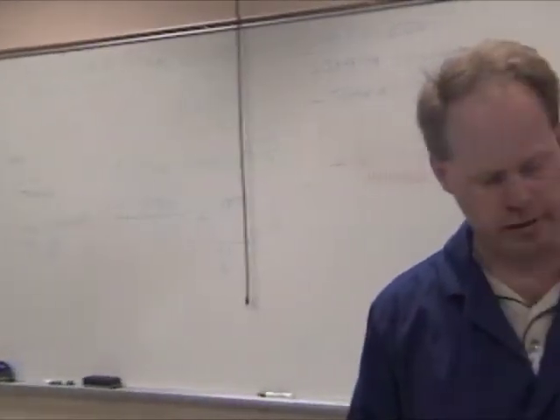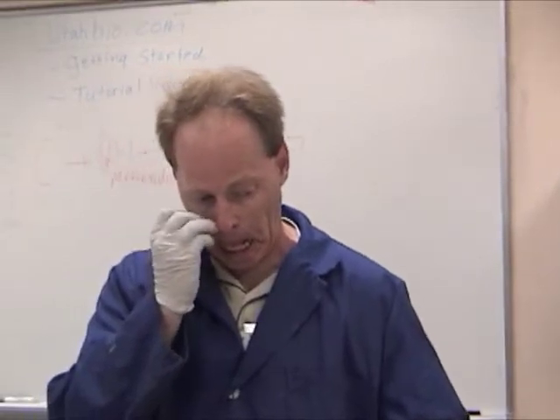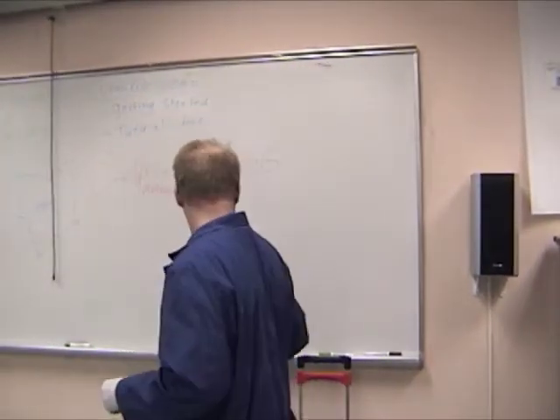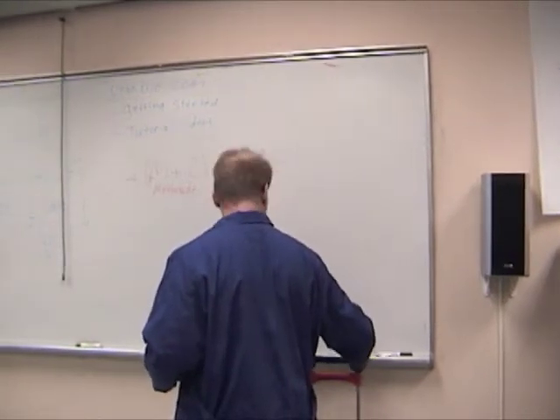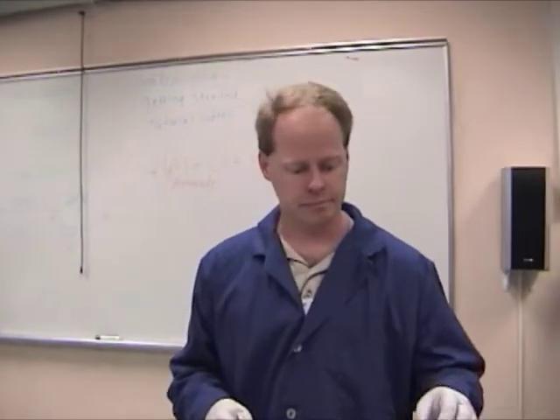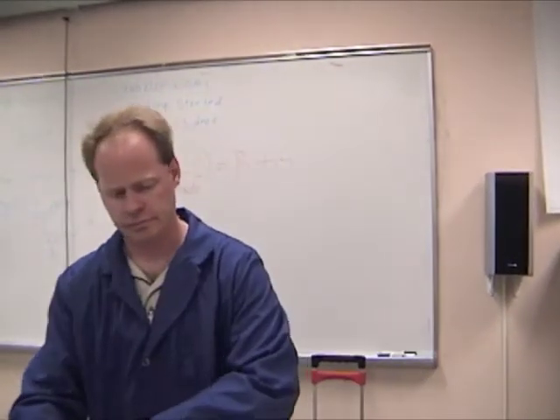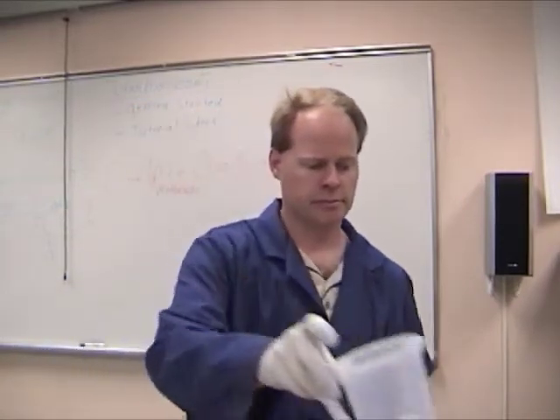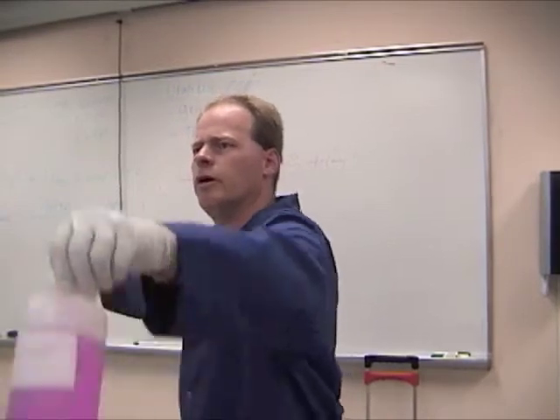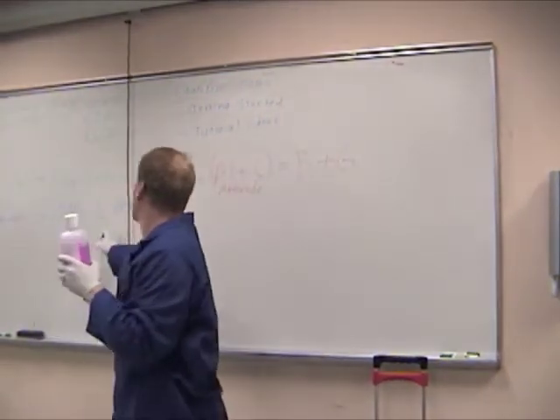Okay, you ready? That's all mixed up? Should be. Is this the good stuff to play with? Is that phenol? No, that's the 1% solution. The reason that's purple is I put 2 or 3 drops of phenol in it, so I know what it is at a glance, because I have methanol, I have distilled water, I have KOH solution, etc. So I know the purple stuff is the 0.01. So this is a basic solution, so it's going to turn pink because we're up in this range.